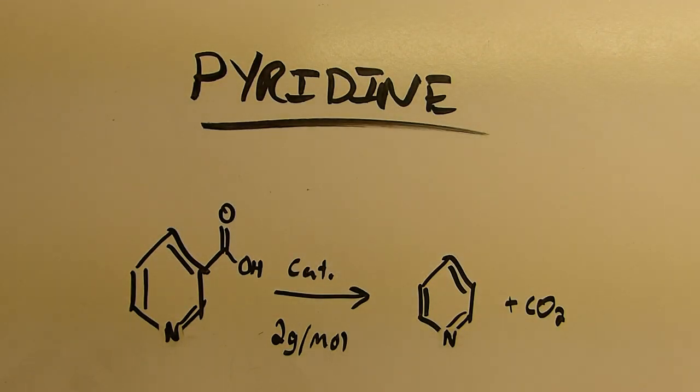Hi everyone and welcome back to the lab. In this video I'll be making pyridine by decarboxylating niacin. So this is niacin right here. It's also known as nicotinic acid and that's because it's a hydrolysis product of nicotine, the same nicotine you might find in cigarettes and other tobacco products.